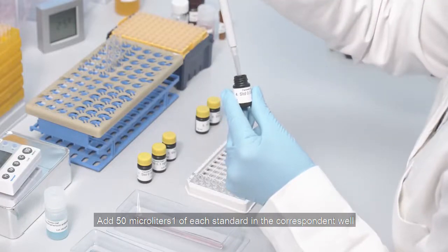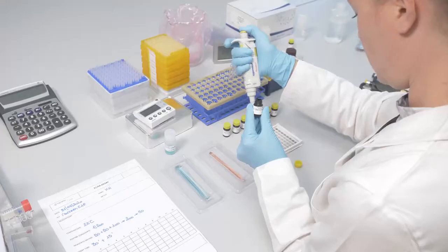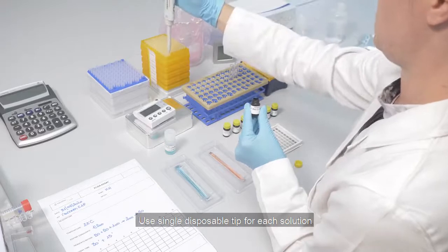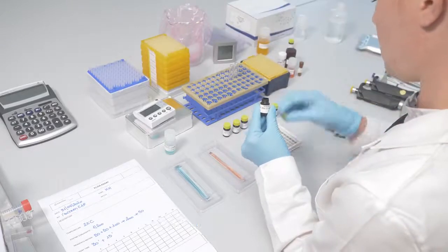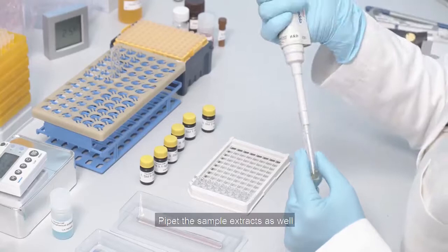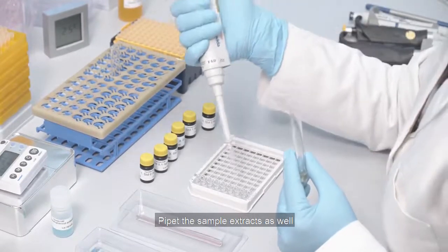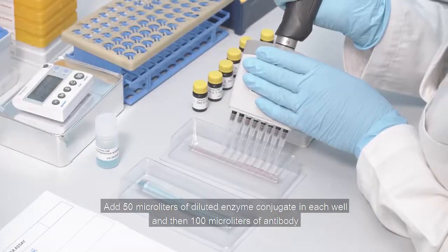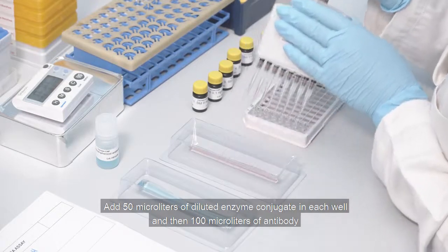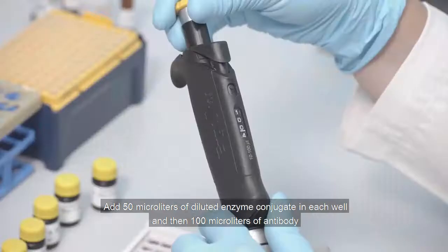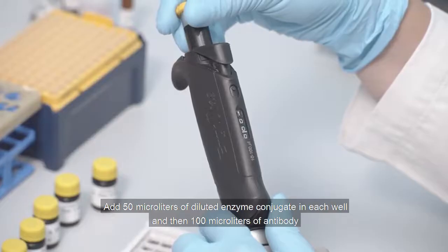Use a single disposable tip for each solution. Pipette the sample extracts as well. Add 50 microliters of diluted enzyme conjugate in each well, and then 100 microliters of antibody.